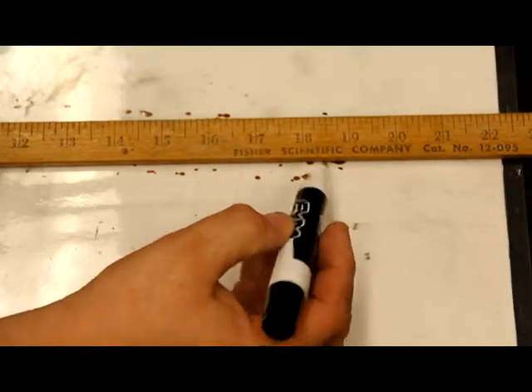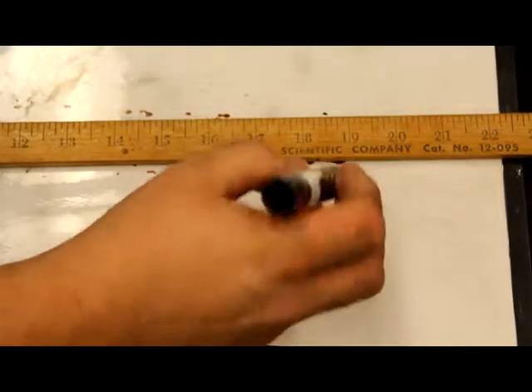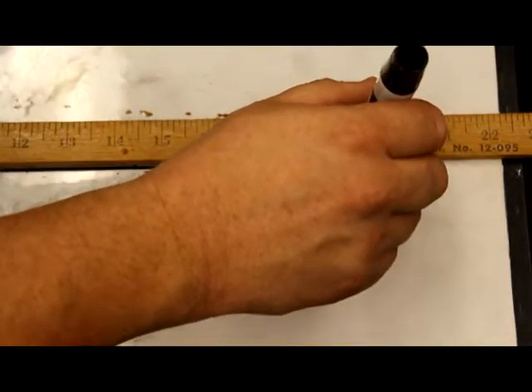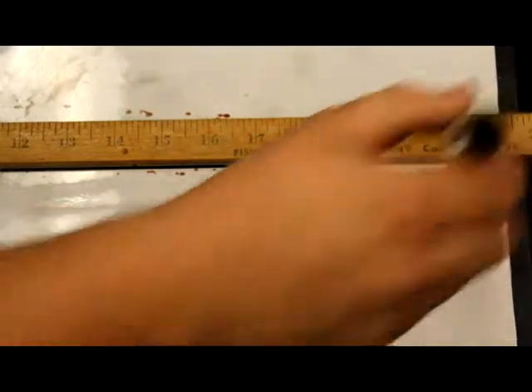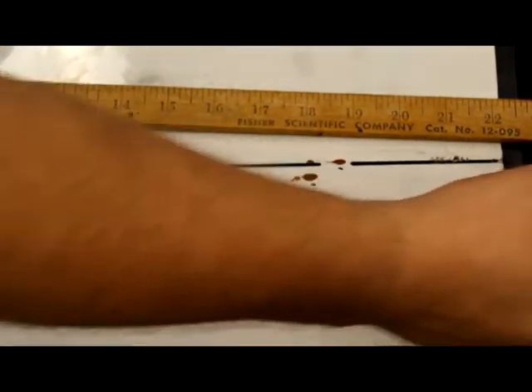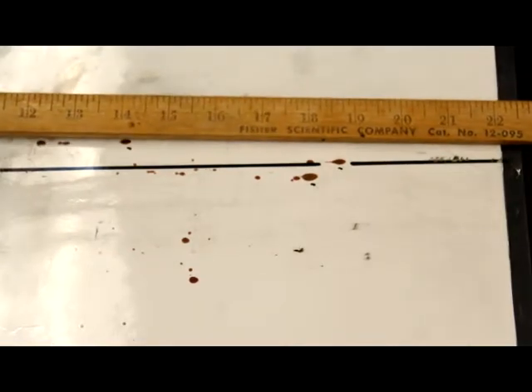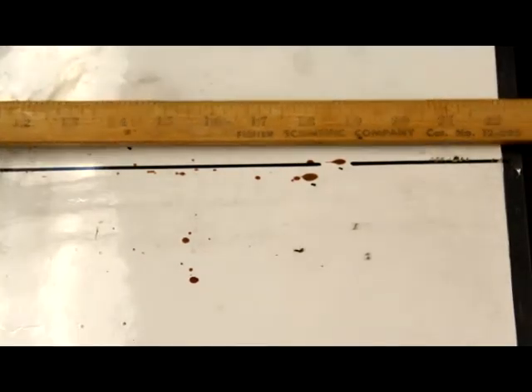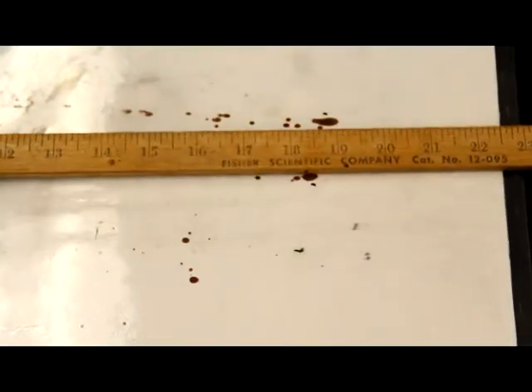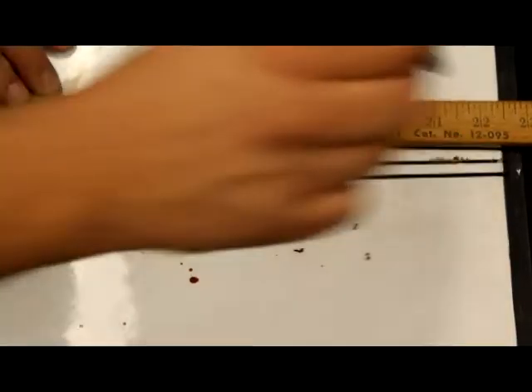And then using your dry erase marker, you're going to draw a line that basically gives you your direction towards your area of origin. You're going to do that for each one of these. So you can see that we're left with a pattern that looks like this.